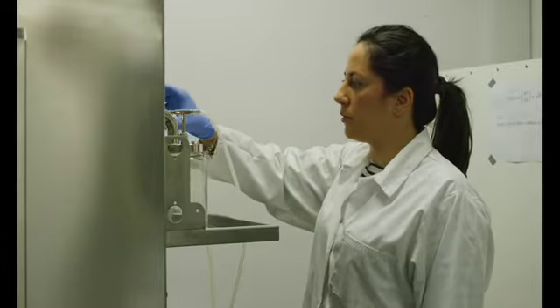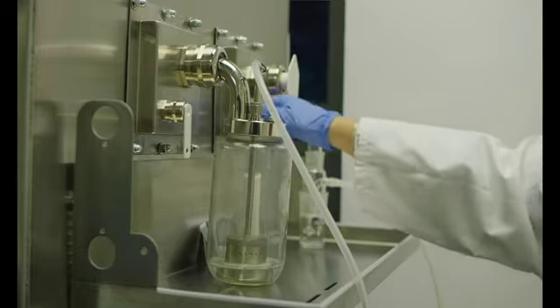We have both a small and large chamber to allow us to perform a greater number of tests on the efficacy of the product.